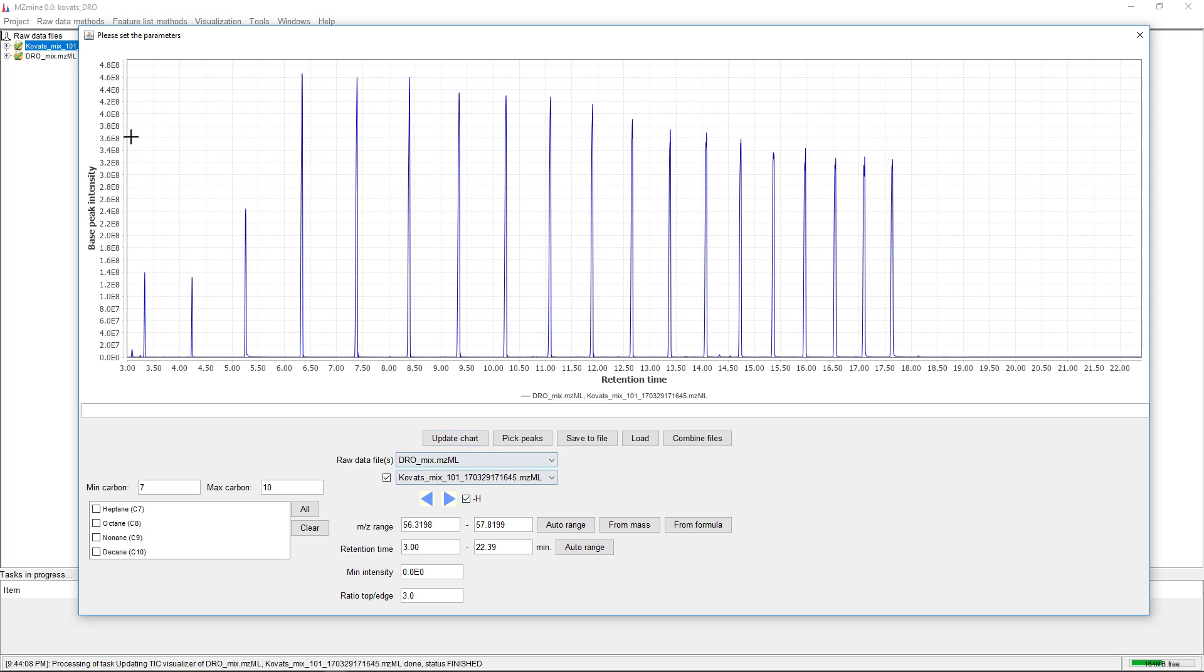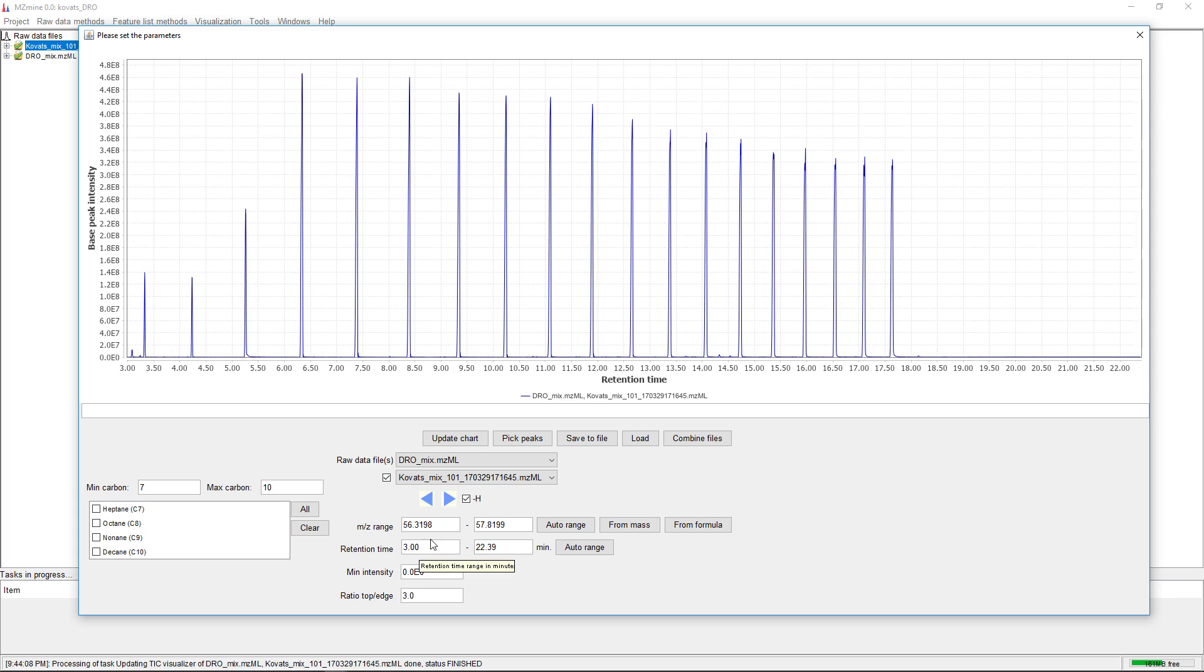To define the peaks in the base peak plot, we need to adjust these settings. We have the mz range and retention time range.